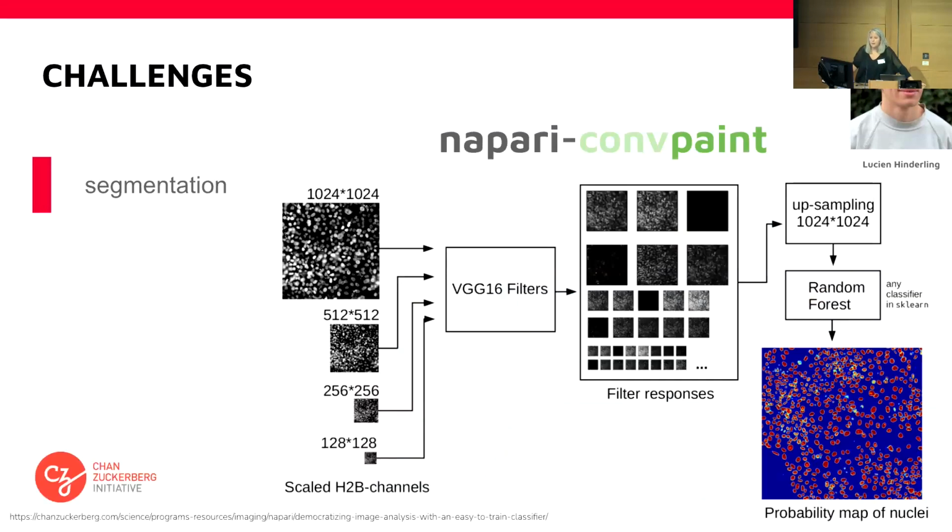And he got funded by the Chan Zuckerberg Initiative. And here is the architecture. We input images, but we also input them at different scales, because some features are easy to recognize at smaller scales. So we downscale the image, we put it in the model, and then we extract these features.